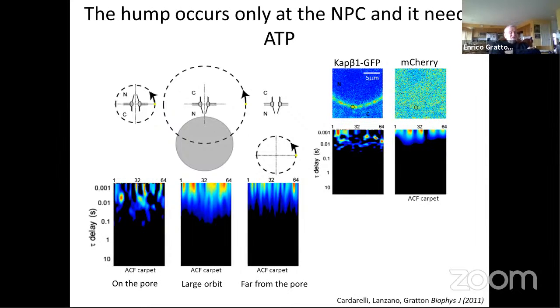So the tracking is done to track always one nuclear complex. If you do a line, you don't know which one you're tracking. So the reason why we do it with a circular scan is, first of all, you see both sides very clearly, and then you know which side. But you can do that with the line. But if the nuclear complex moves out of the line, well, what do you do?